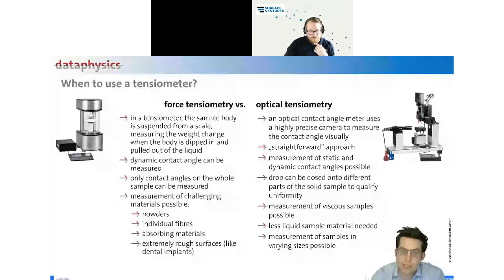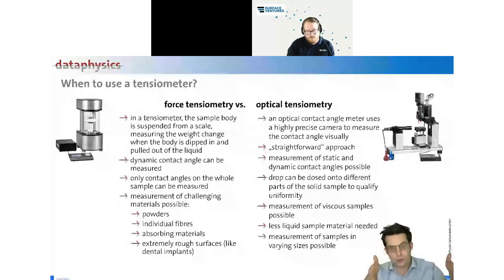But what if I want to still improve the wettability of the surface? Because you have seen from before, wettability is an important characteristic for how well cells adhere to this material, and how well a new bone replacement material gets accepted. This depends on how strongly the cells adhere. So there must be a way that we can still quantify differences between very, very hydrophilic surfaces.